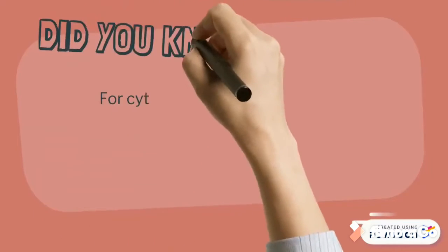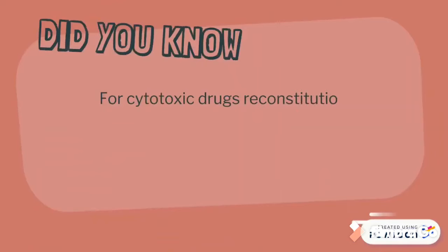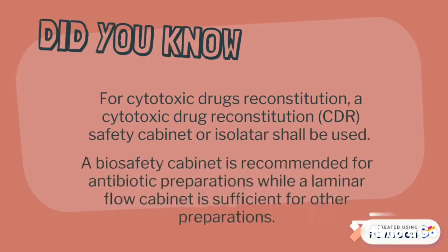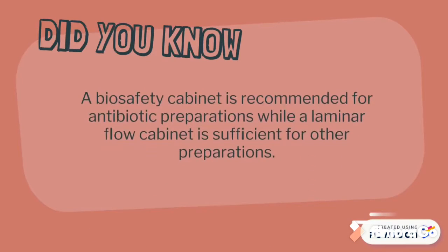Did you know? For cytotoxic drug reconstitution, a cytotoxic drug reconstitution CDR safety cabinet or isolator shall be used. A biosafety cabinet is recommended for antibiotic preparations while a laminar flow cabinet is sufficient for other preparations.